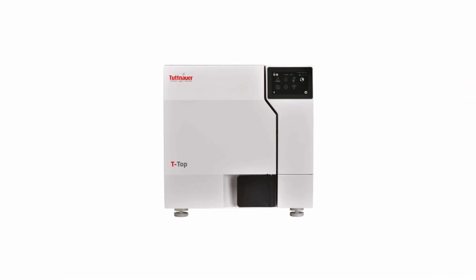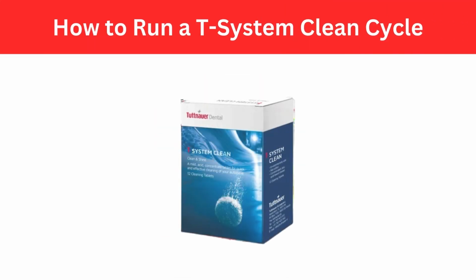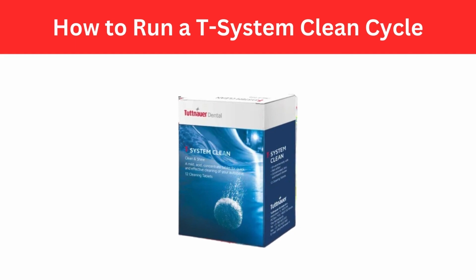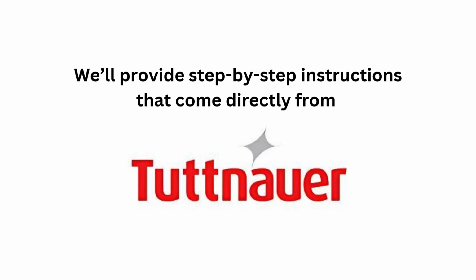In this video, we'd like to go over maintenance on the Tuttnauer T-TOP autoclave. Specifically, we'd like to focus on how to run a T-system clean cycle using their cleaning tablets. We'll provide a step-by-step guide with instructions directly from Tuttnauer.